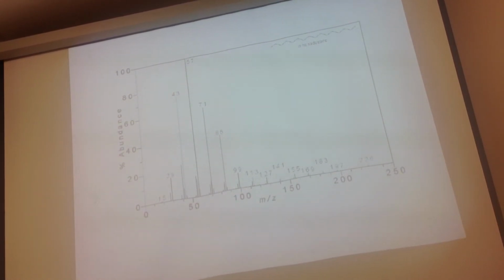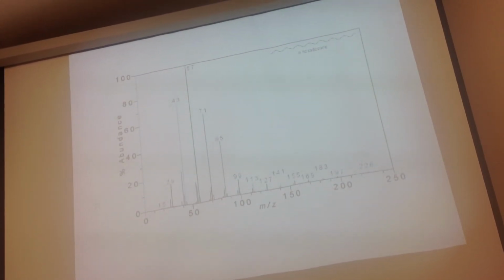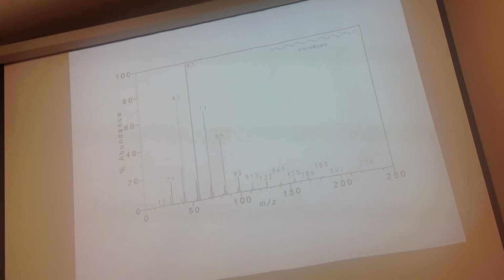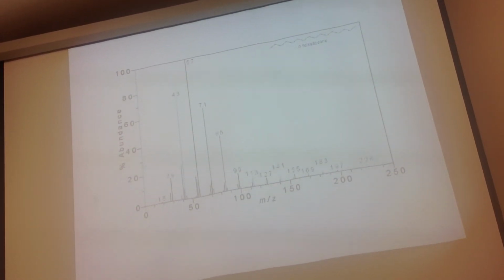So, I see questions. The 226 wasn't there when you were looking for it. Oh, it's okay. It just tells you that your molecule completely blew apart, and there was no detectable parent. So sometimes it's there, sometimes it's not. And if you see it, it's like, yes. And if you don't, oh well. Then you have to start looking at fragments.